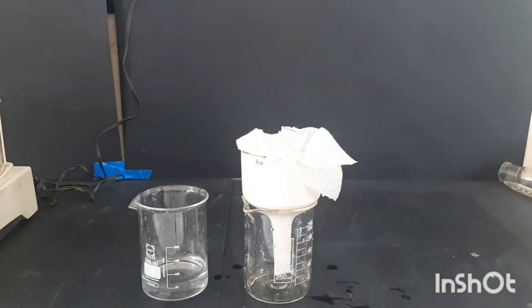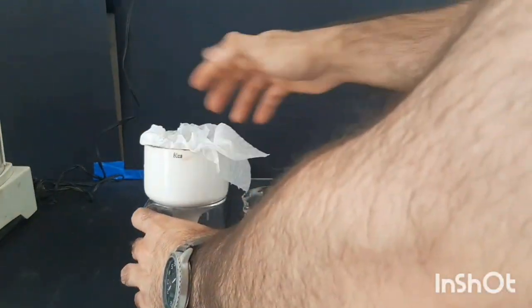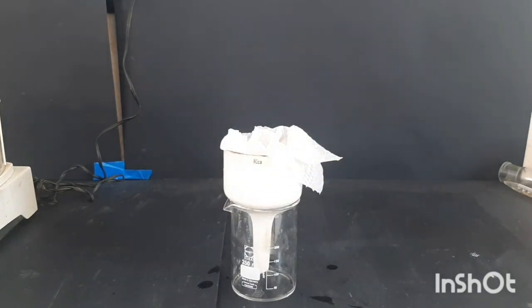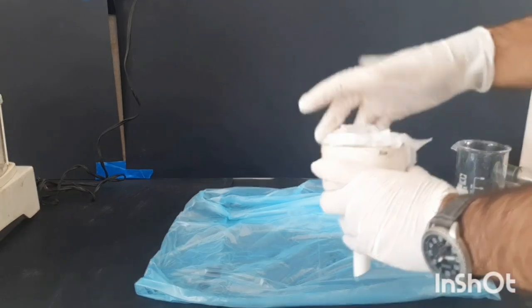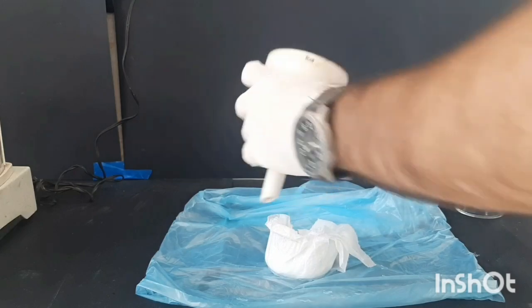So I washed the adipic acid with some distilled water. Every time I washed the adipic acid with some water, the smell decreased, and with the last washing the water did not smell. So I'm gonna put the paper towel containing the adipic acid on some plastic bag to dry.